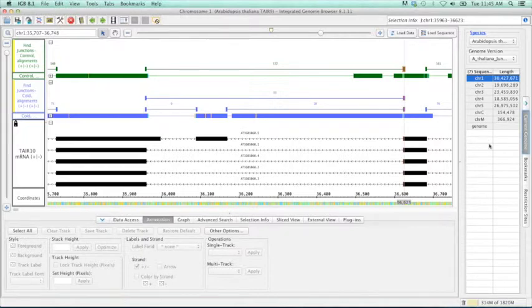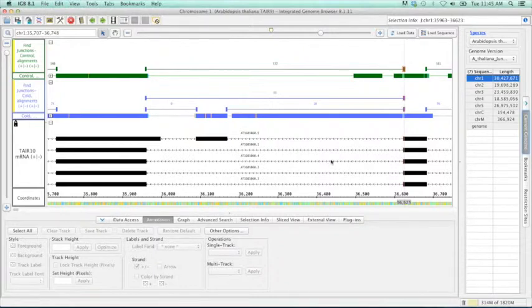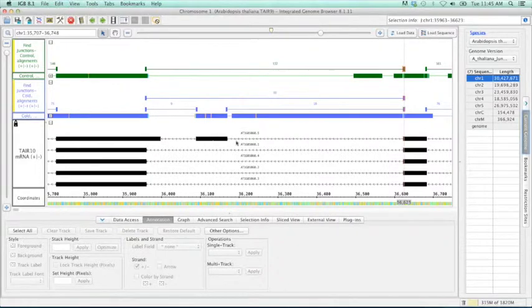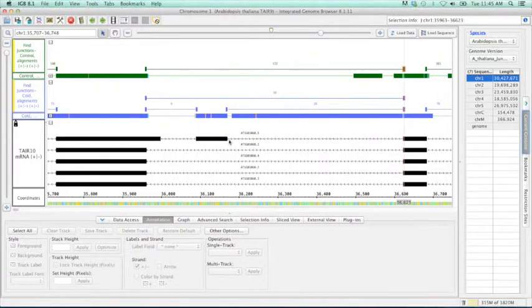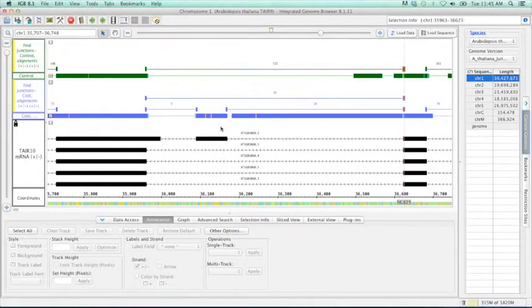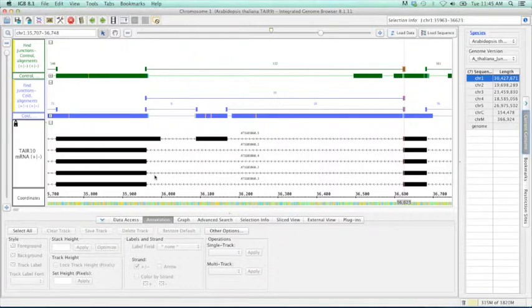For this example, we are going to design primers within these flanking exons. The idea being that we can then look to see just on a gel, whether or not we have this exon included or not. If the exon is included, the gel size should be larger than if it is excluded.